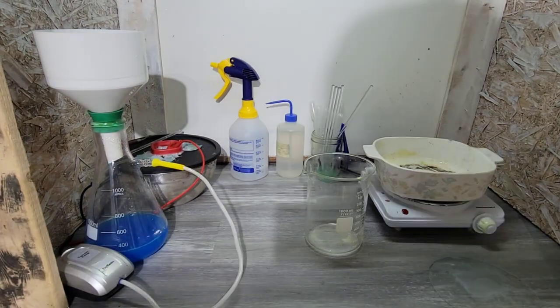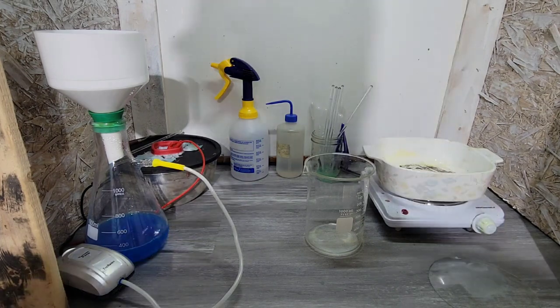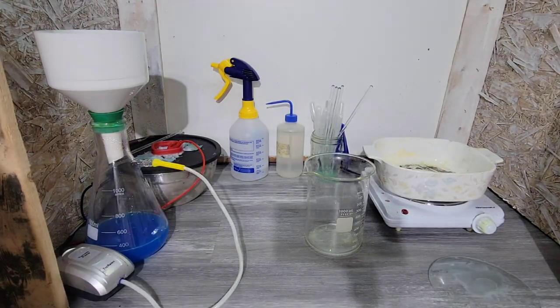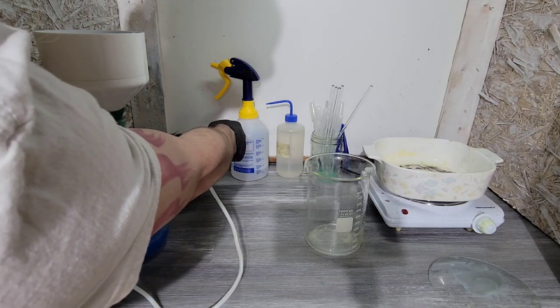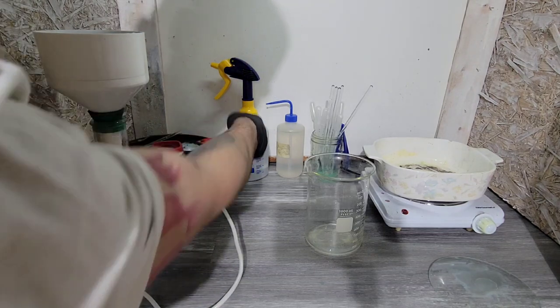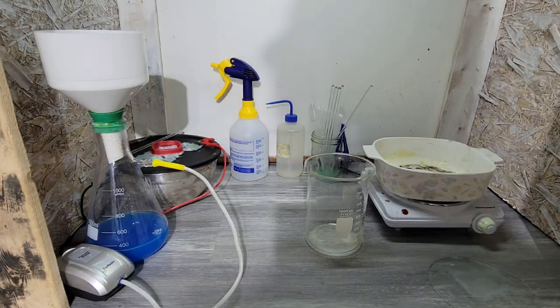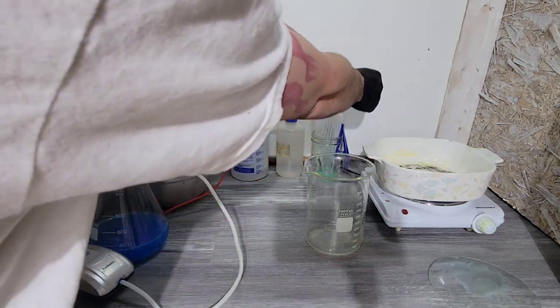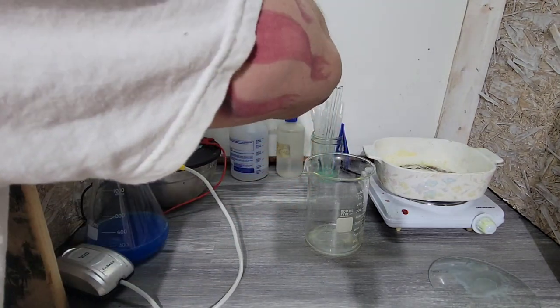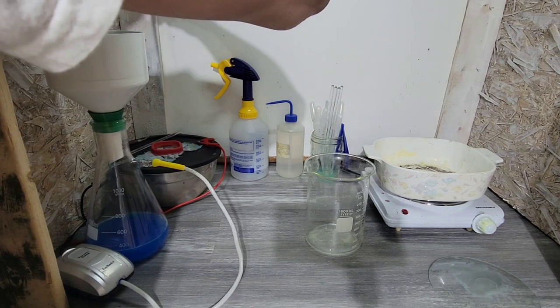All right, just about done filtering here. Go ahead and take the anode out. Well, what's left of it. There's the leak.